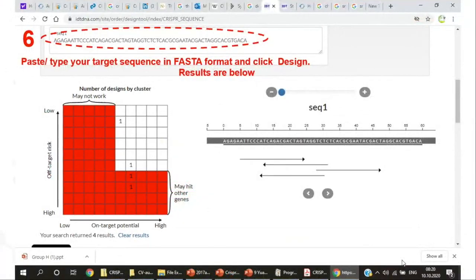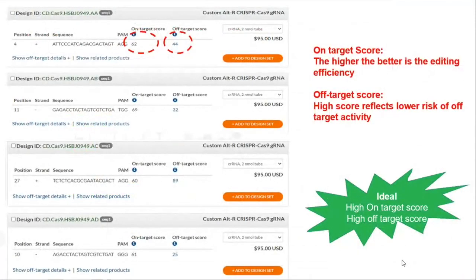So perfect. At least 92% of the targets we were able to design. They were okay, so this is a good result. So far, so good. Okay. Perfect, 93% now. Great. Very nice. Thank you so much, guys.